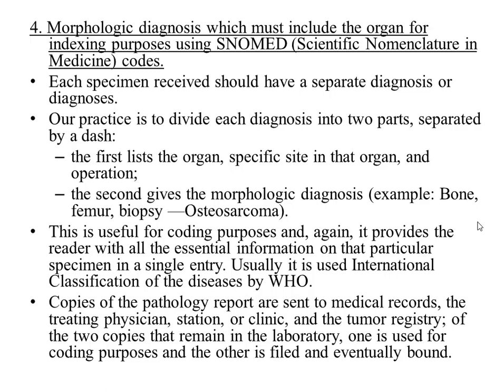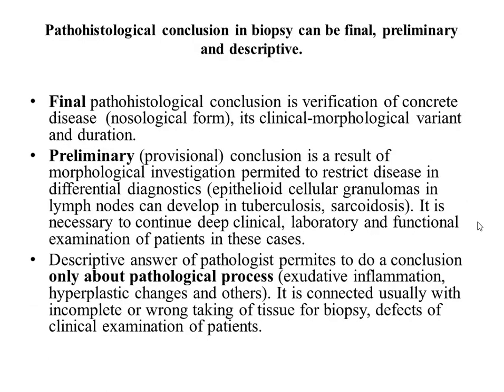Copies of the pathology report are sent to medical records, the treating physician, station or clinic, and the tumor registry. Of the two copies that remain in the laboratory, one is used for coding purposes and another is filed and eventually bound. The pathomorphological or pathohistological conclusion in a biopsy can be final, preliminary, or descriptive.